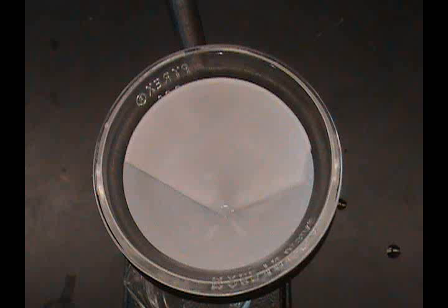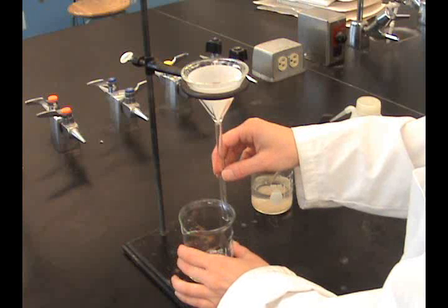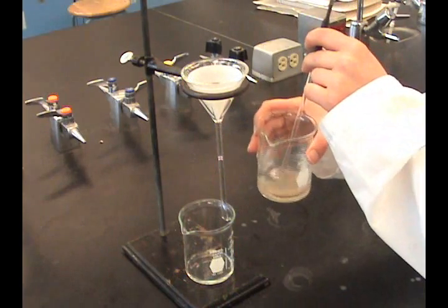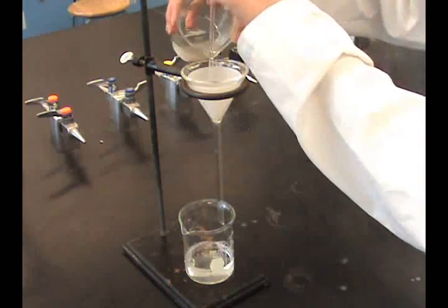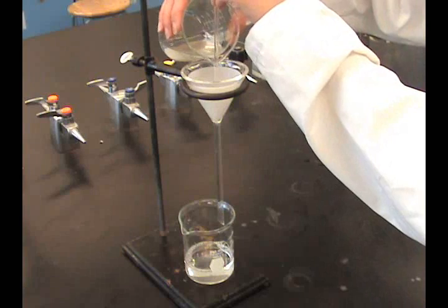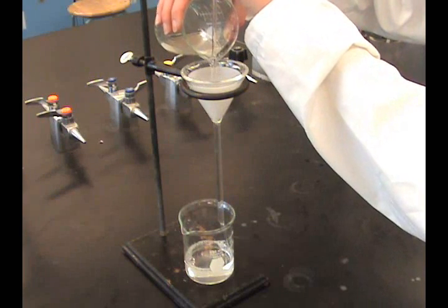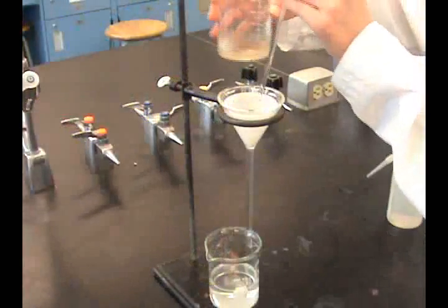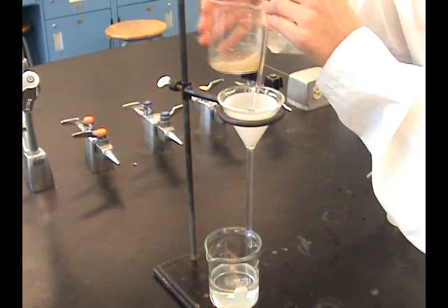Make sure the tip of the funnel is touching the side of the receiving vessel for proper flow. Swirl the solution to suspend the solid and liquid. Pour using a glass rod to guide the solution, keeping the level of solution no more than three quarters full in the filter paper.